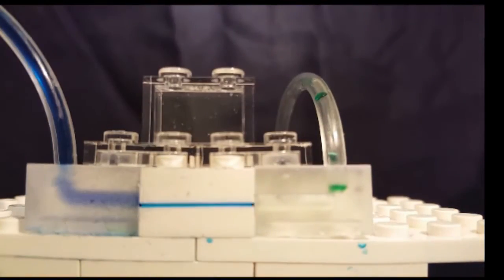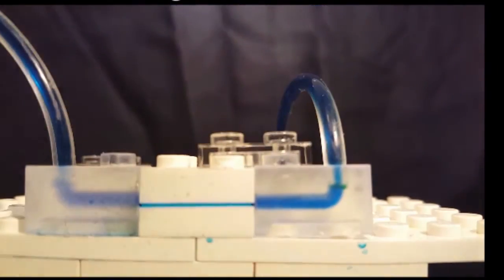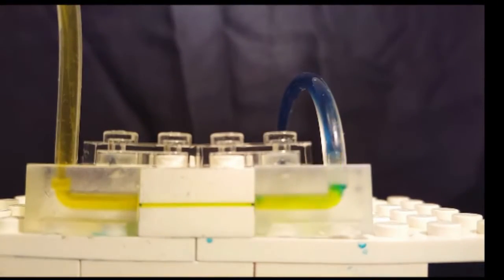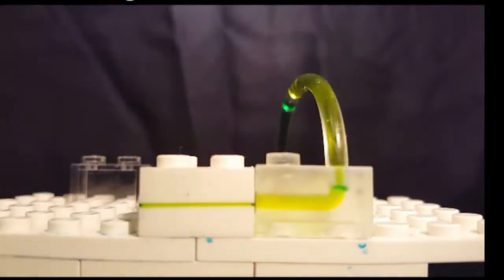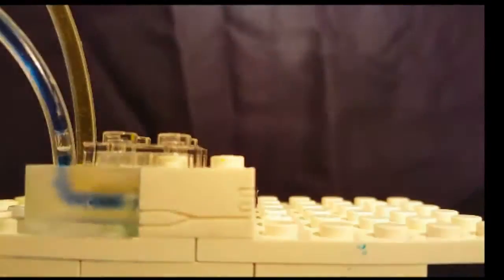MIT researchers have developed a new platform for microfluidics using Lego bricks. The field of microfluidics involves minute devices that precisely manipulate fluids at sub-millimeter scales.